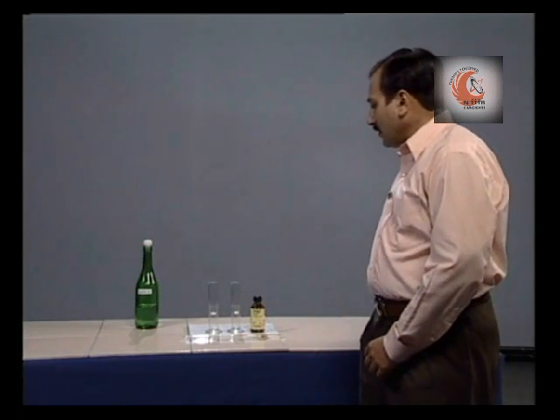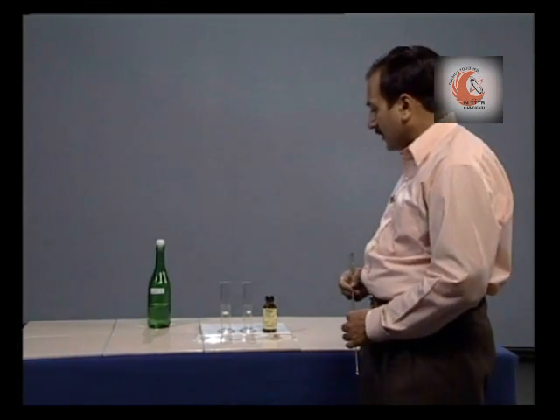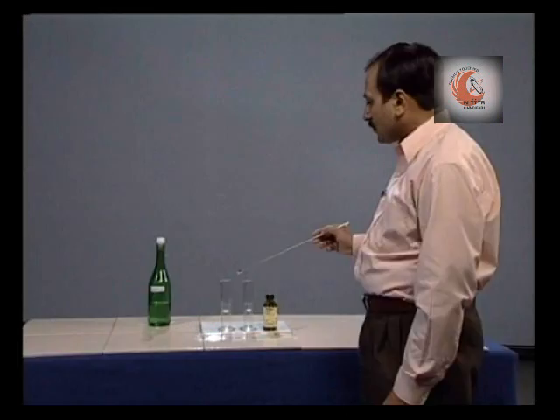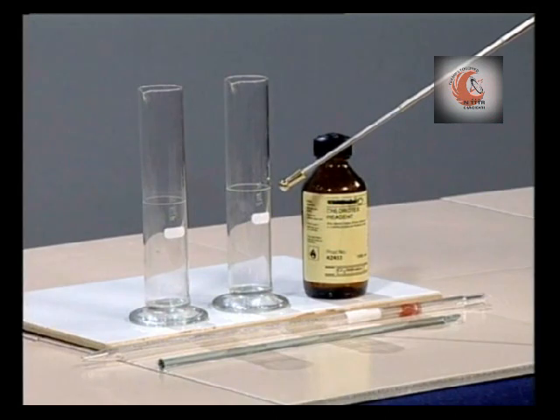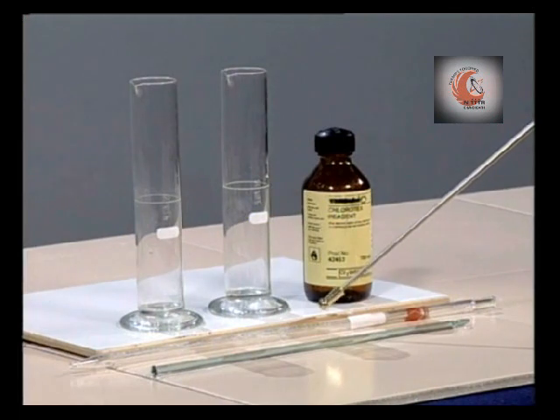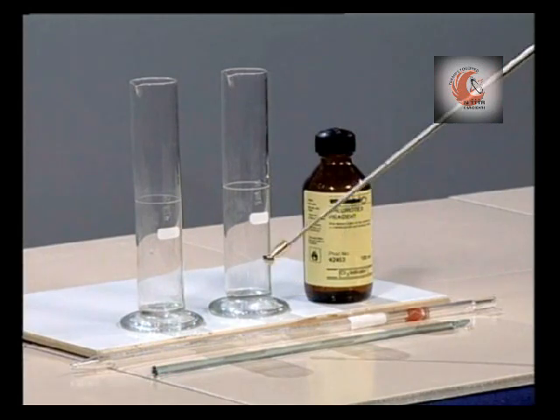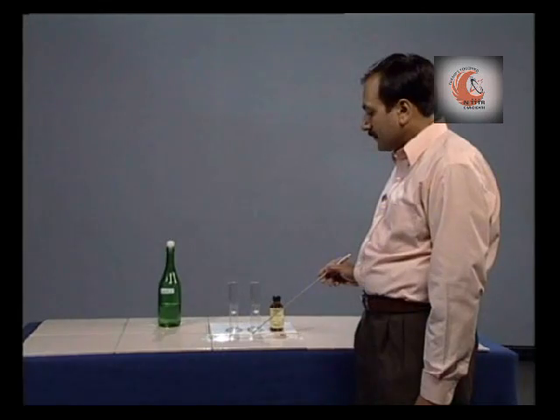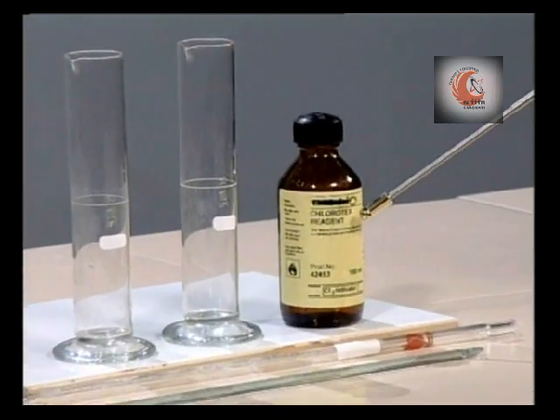Another method of measurement is using a chlorine kit. The residual chlorine kit is an assemblage of glasswares and simple chemicals. We have two cylinders having graduated mark for 50 ml, a pipette of 5 ml capacity, or we can use a cylinder also of 5 ml capacity, a glass rod and Chlorotex reagent.